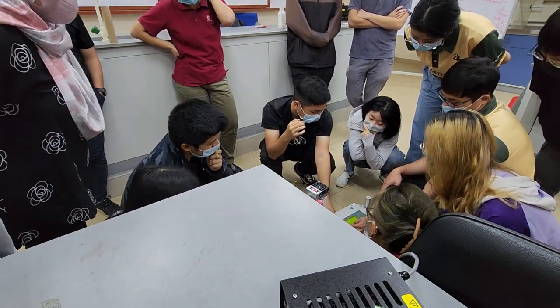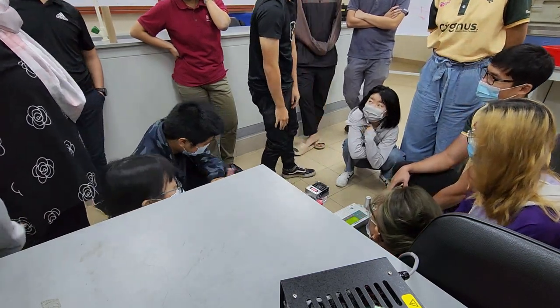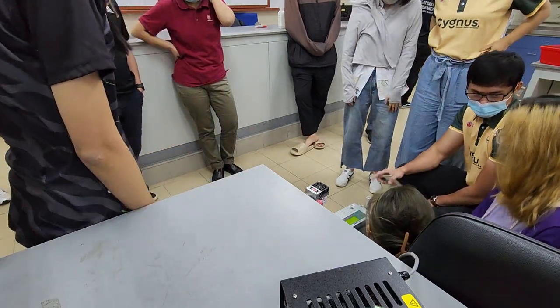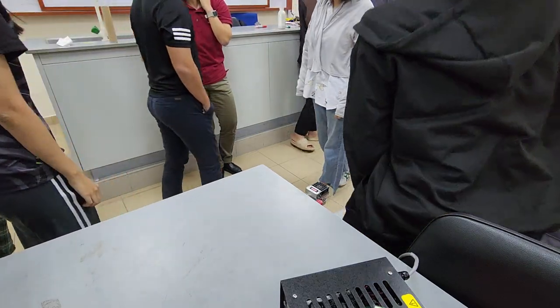So this one, how should we wait? This is the best time to test, when the graph is stable, like this. So you just show on the whiteboard.